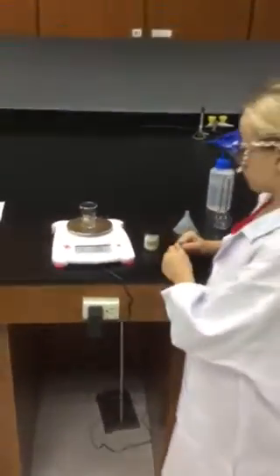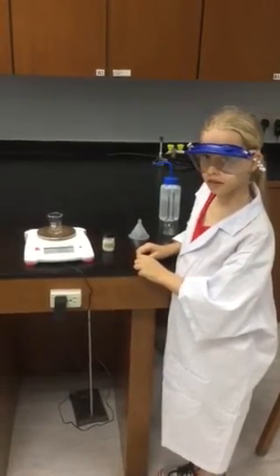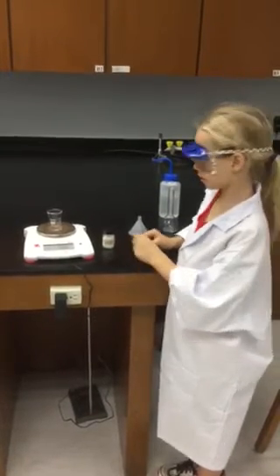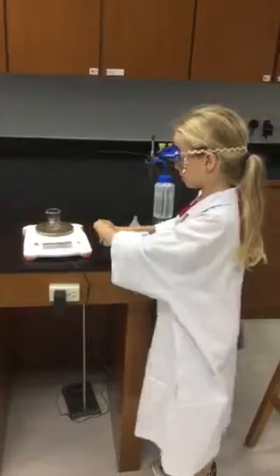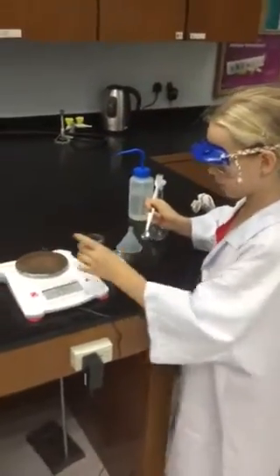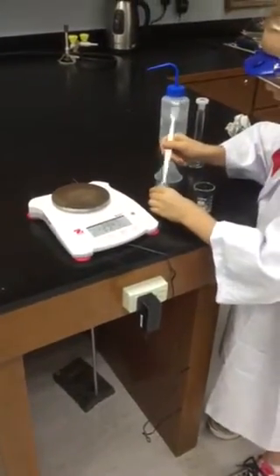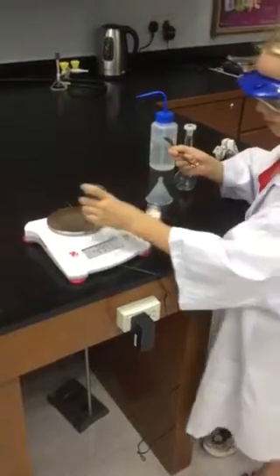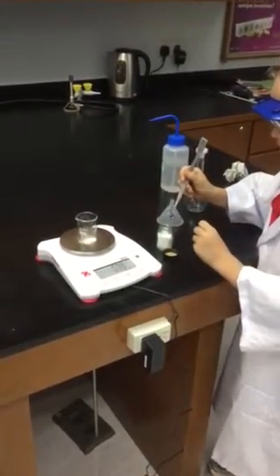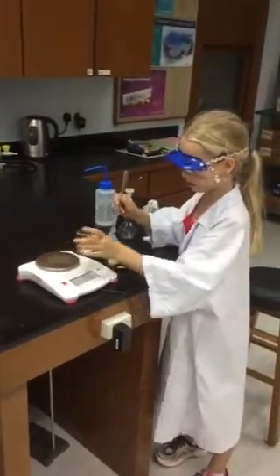Now, Nina, for your solution, you're going to need to find the mass into your beaker of, let's say, 1.55 grams. Can you do that, please? Notice that Nina is not putting the solid into the beaker when the beaker is on the balance. She removes the beaker in order to put the solid inside so as not to dirty or get solid on the balance itself. That's how these balances get damaged. This balance costs about $300 US.